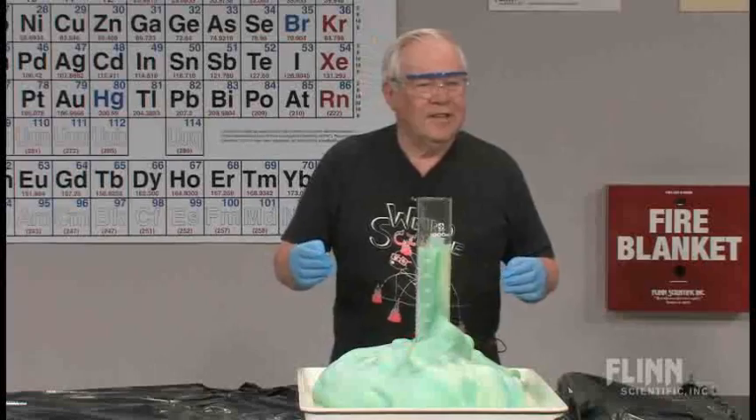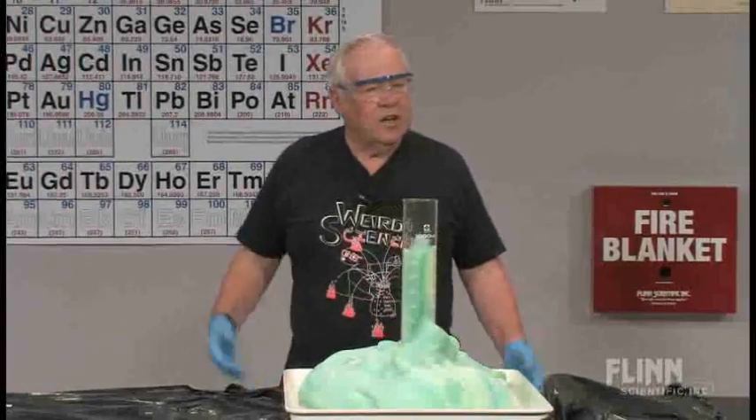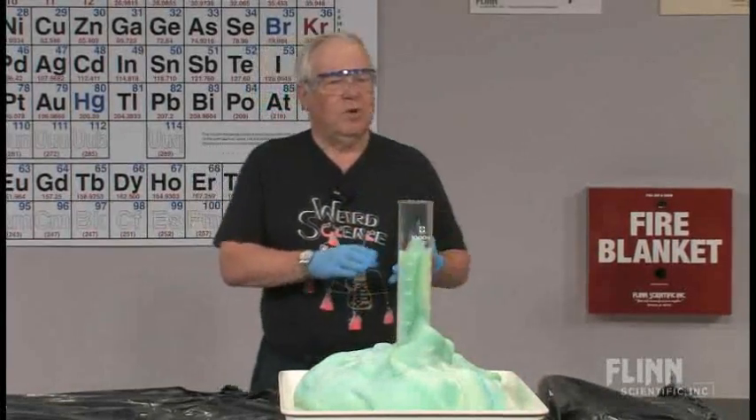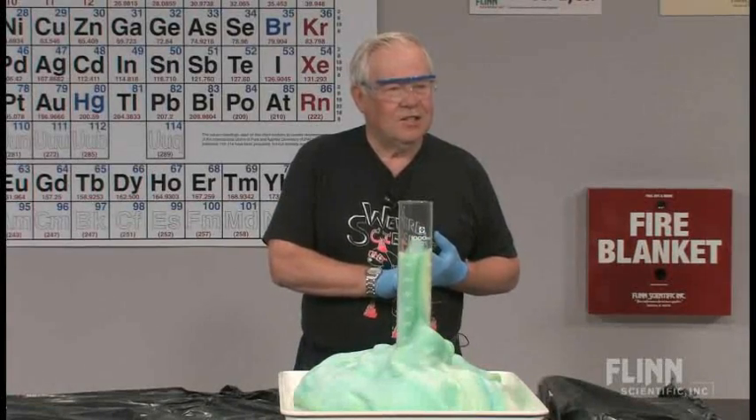The heat was enough here — you could see some steam come off when it started. So you can do it when you have exothermic reactions. You can do it when you have oxidation reduction, because this is an oxidation reduction reaction.